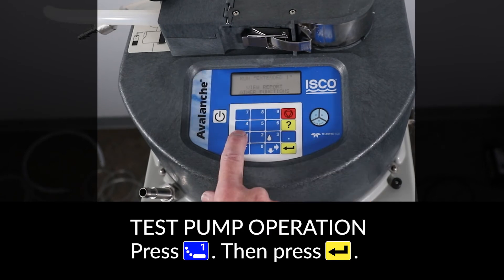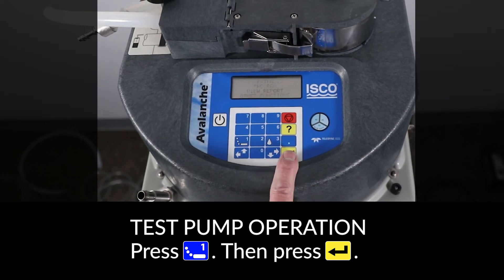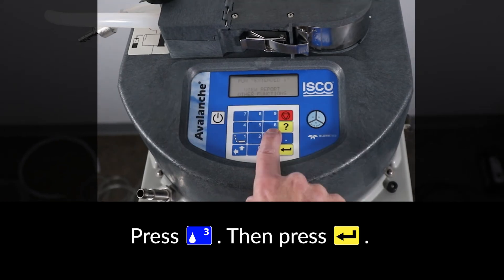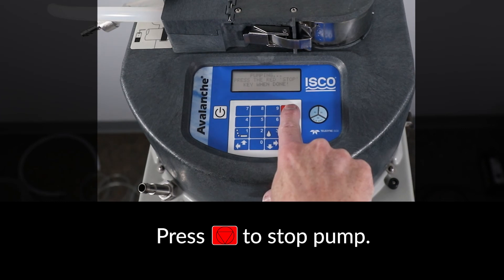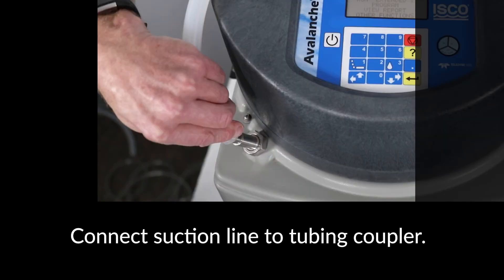To test the pump operation on the new tube, press the number 1 button followed by ENTER to run the pump in the reverse direction. Press the red STOP key to stop the pump. Next, press the number 3 button followed by ENTER to run the pump in the forward direction. Press the red STOP key to stop the pump.